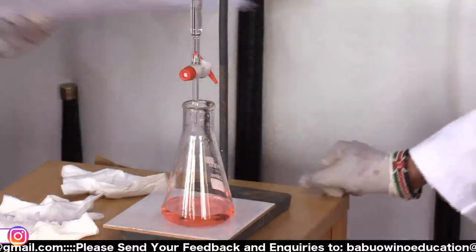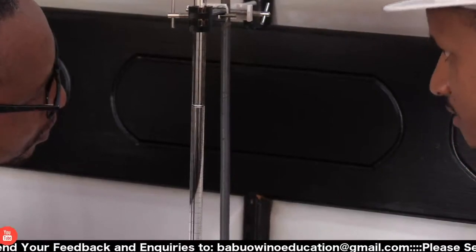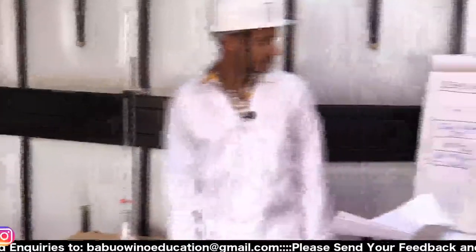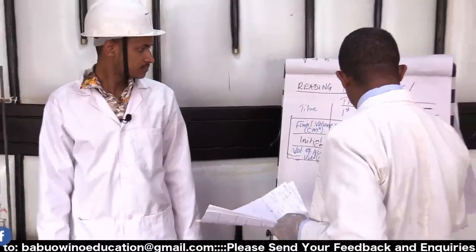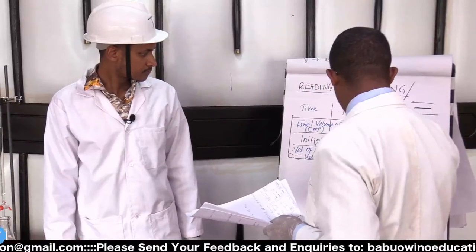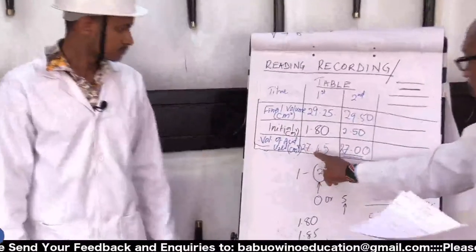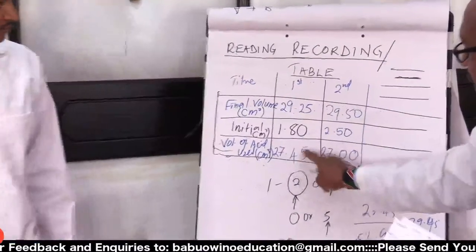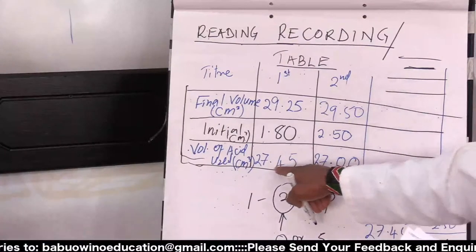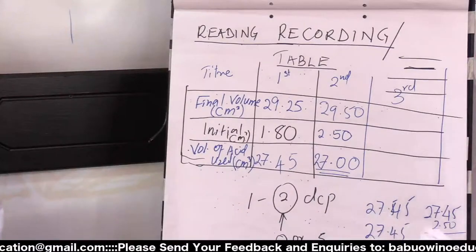Read. So here we have 29.5. So our reading here is 29.5. So that gives us 27.00. So you can see from here that there is a very great difference, meaning we need to be more accurate. So if you find you are differing by this margin, then it is important that you check a third titer.